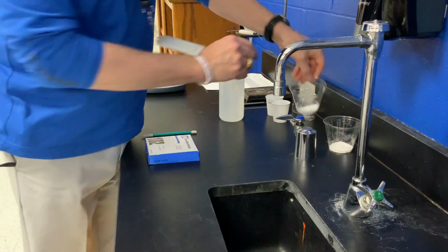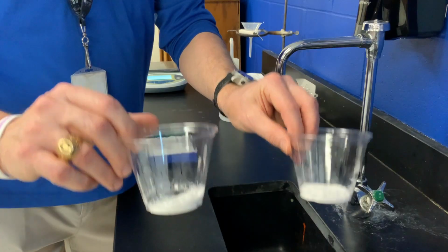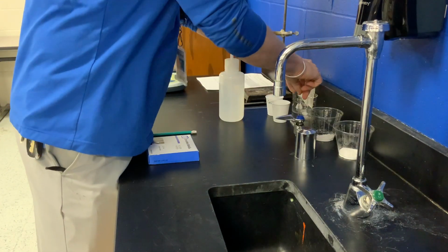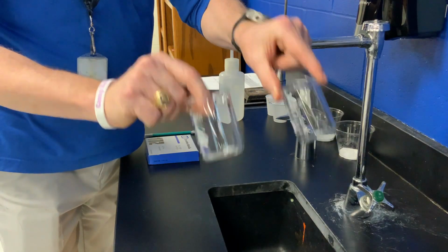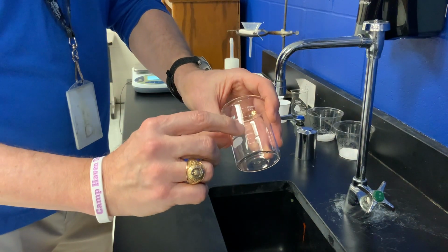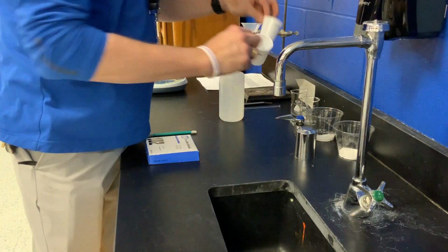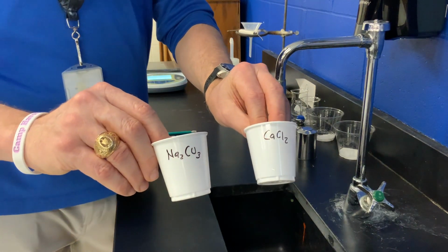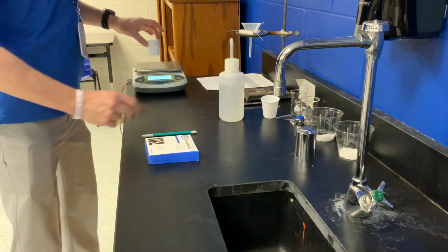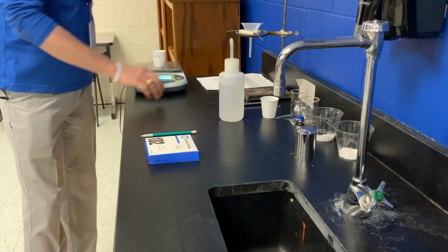Your materials, you'll have the calcium chloride and sodium carbonate, a pair of those for every 2 labs. Every lab will have 2 100 ml beakers. It says to fill up to 50. You'll see the little marks on the beaker. You can use those. You'll have 2 white cups. These are for weighing the solids. Remember that you need to zero the balance before you weigh the solids.